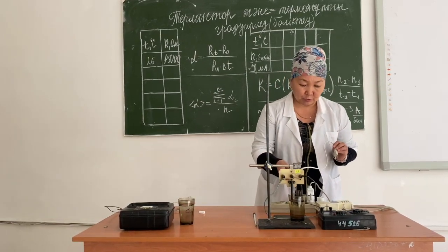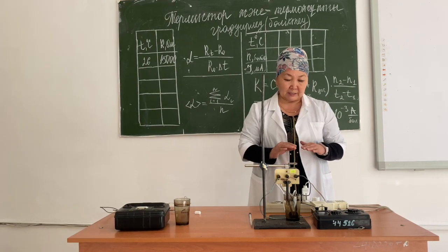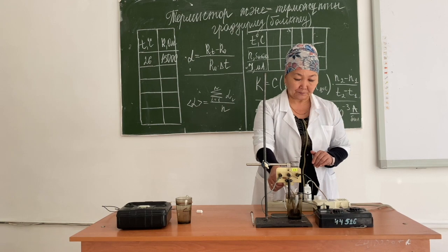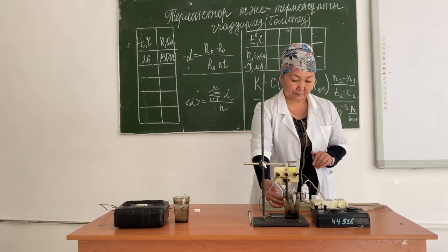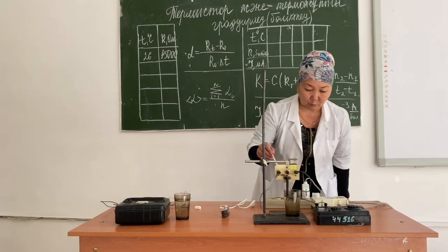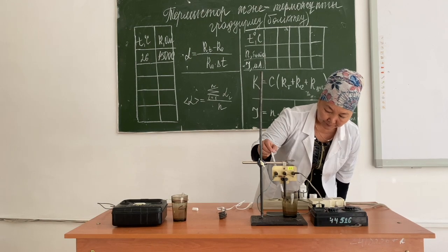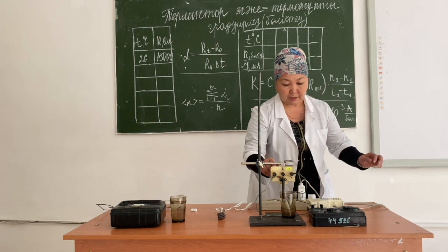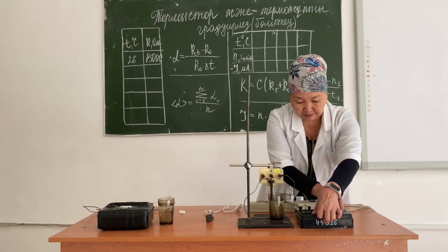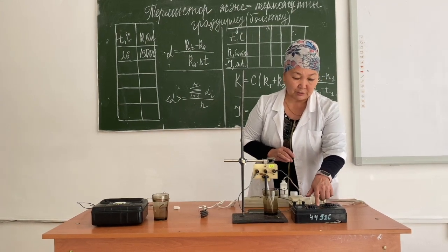Now we need to change the temperature of the thermistor. To do this, we use an ordinary water heater. We immerse the heater in water and heat it; at the same time, the temperature of the thermistor will also increase, because the thermistor will reach the same temperature as the water. At 32 degrees Celsius, we press the button, the galvanometer arrow goes to zero, and the scale shows 9 — multiplied by 1000, we get 9,000 ohms.